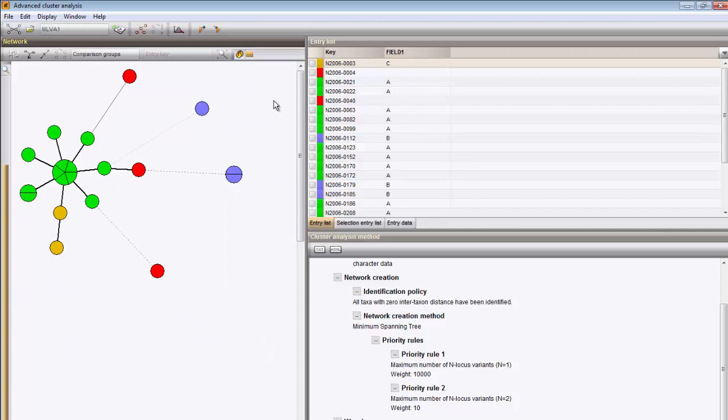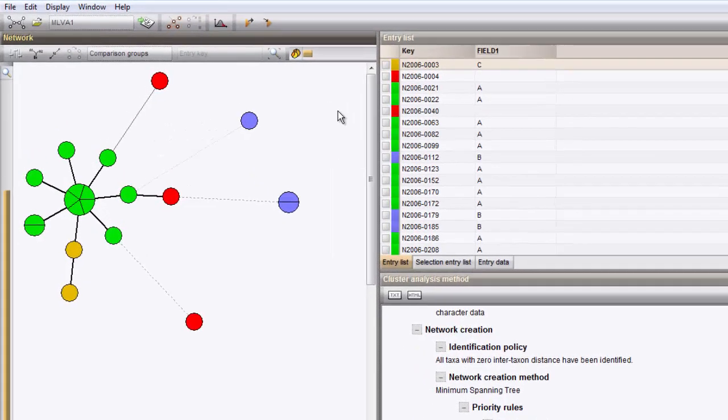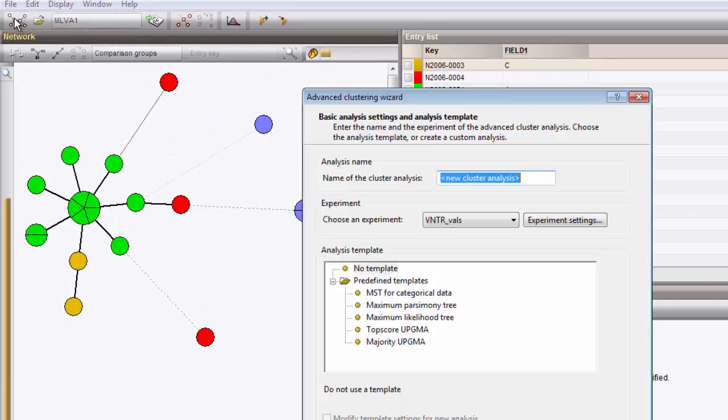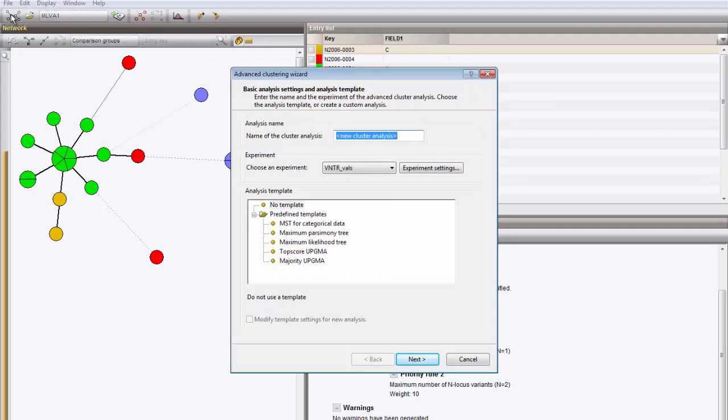In case you'd like to recalculate the tree with different priority rules, click the first button from the left to start a new analysis. I give it another name.